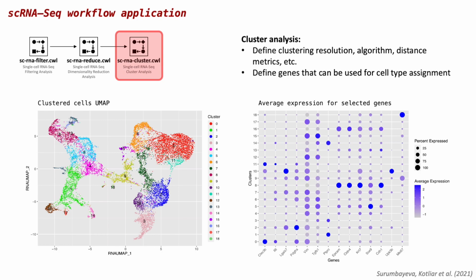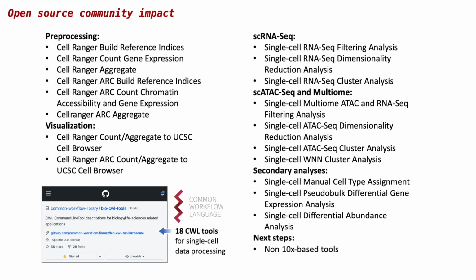To sum up, I would like to mention that I briefly discussed only 3 out of 18 available tools. I'm planning to extend this list with the other tools to provide alternatives to CellRanger as well as to cover several other types of multiome analysis. In the end, all of the developed tools will be contributed to the BioCWL Tools repository.